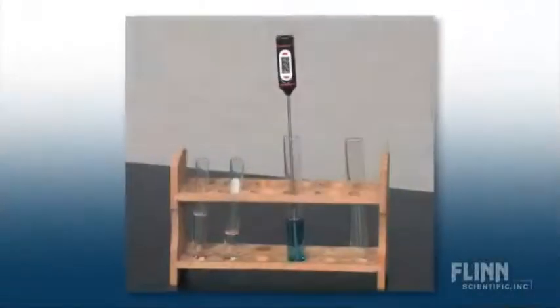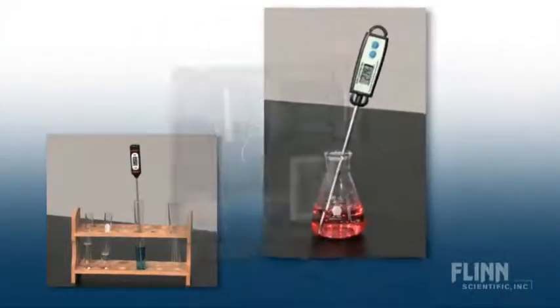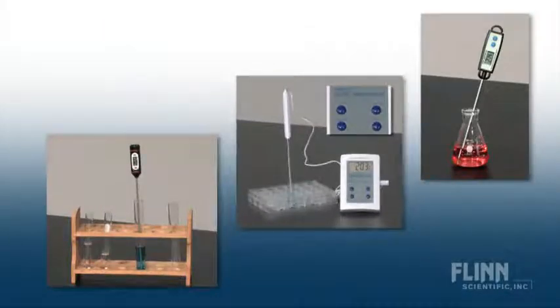No more broken thermometers. Flynn Scientific Digital Thermometers are safe, compact, waterproof, easy to use and very precise. Their lightweight design allows you to easily measure temperature in test tubes, flasks, even microscale well plates, without risk of thermometers tipping and breaking.